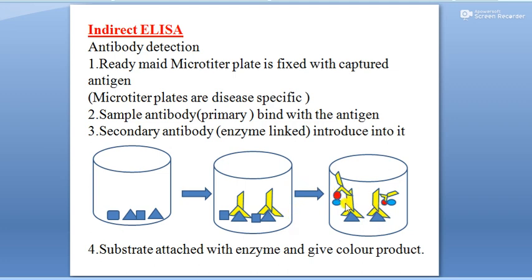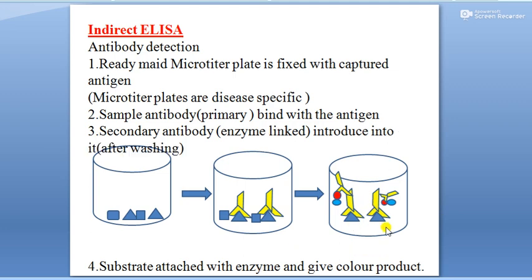So for the specific enzymes we have the specific substrate, that is the chromogenic substance. We need to add those for the special coloration. Point to be noted, you have to wash every time when you add a specific type of enzyme-linked antibody and also a specific type of substrate.